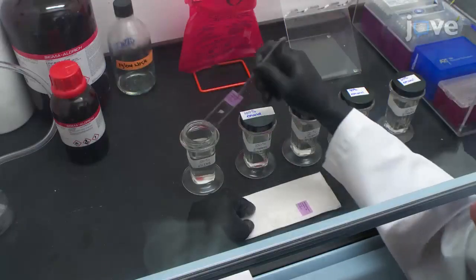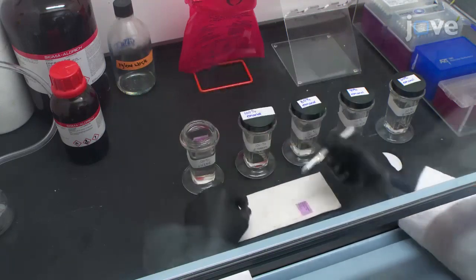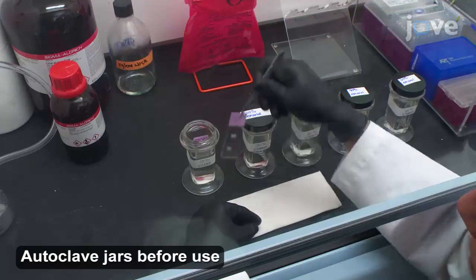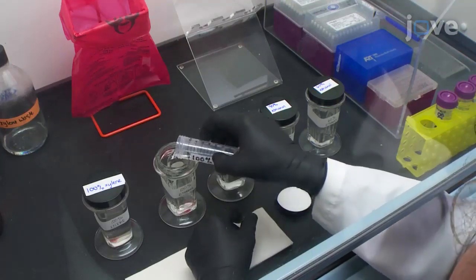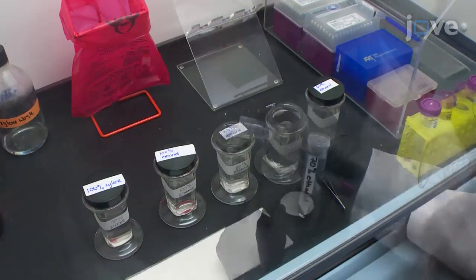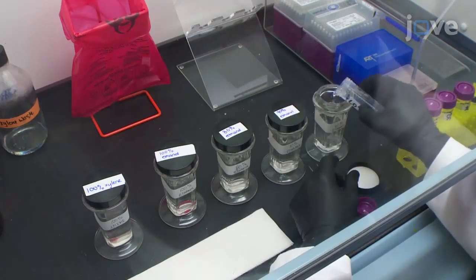To begin, de-wax thin-sectioned paraffin-embedded slides with 100% xylene in glass Coplin jars for 10 minutes under the hood. Next, fill 4 sterile glass Coplin jars with 100% ethanol, 80% ethanol, 70% ethanol, and 60% ethanol, respectively.